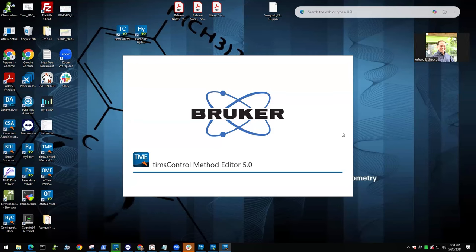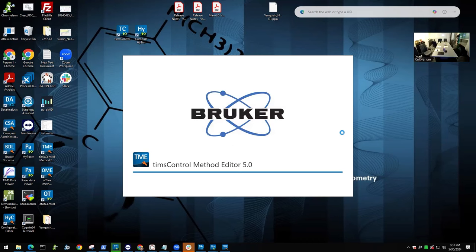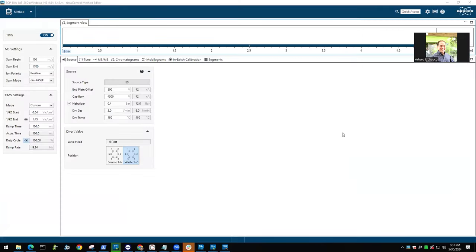We set actual values at each position for collision energy, not a percentage. But we use a higher collision energy for that than a TMT cycle. Or in general for TMT, but for TMT Pro, it's slightly higher.